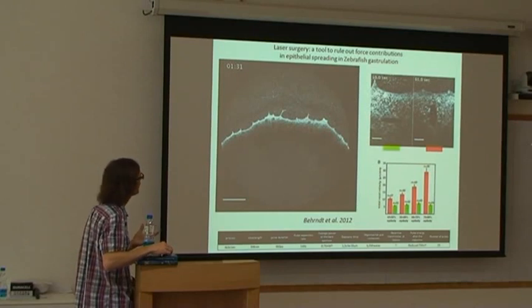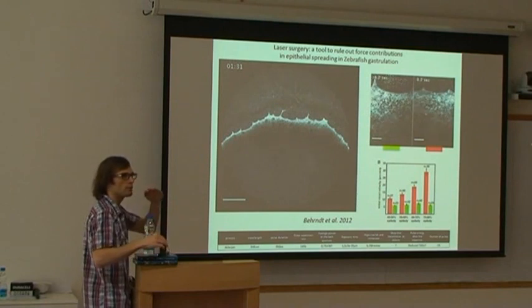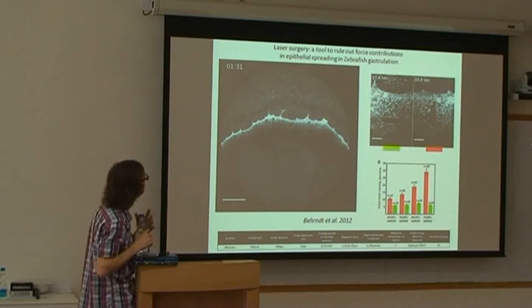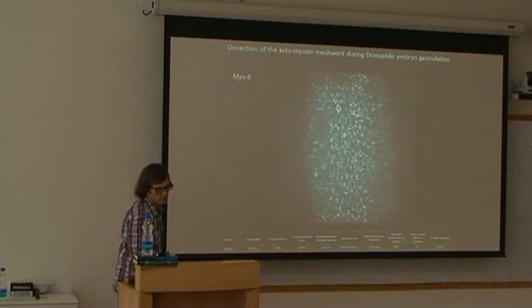The other possibility would be that this is also dependent on the way you cut, but then I would not know how to interpret this. I don't know, maybe because the meshwork probably has some polarity within, even though in this case it seems like quite a random meshwork. Okay, then these are other experiments that I will just show.